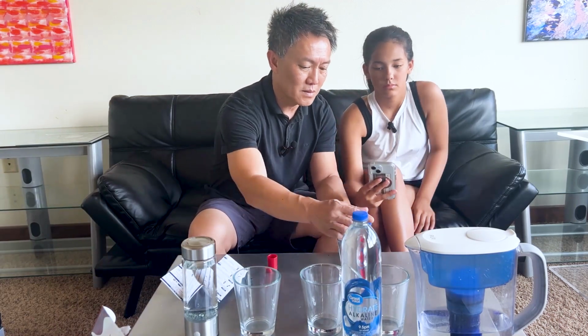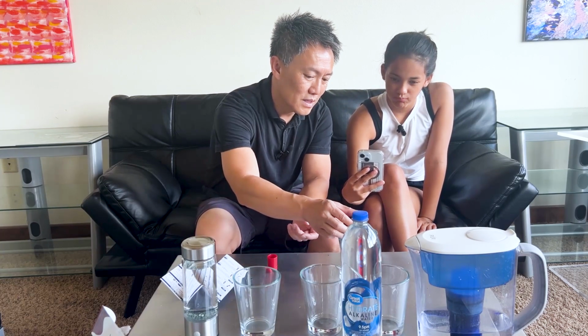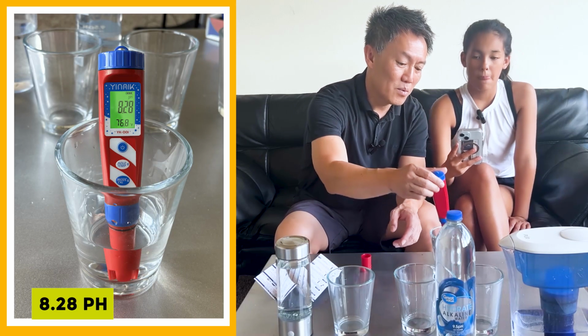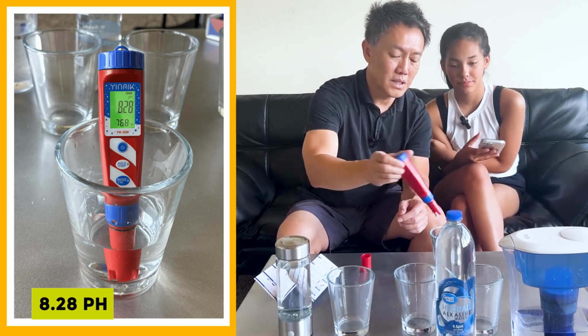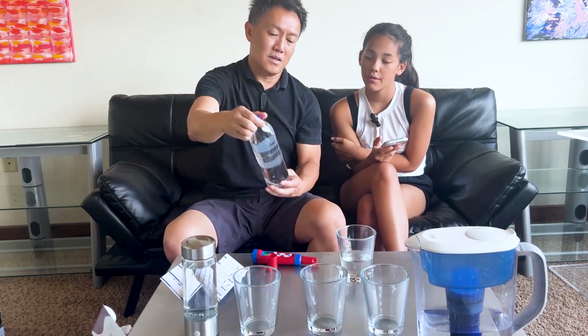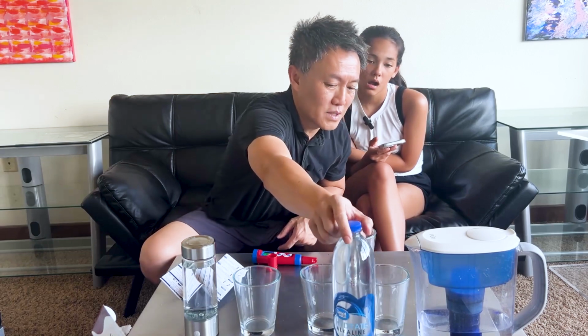And let's just wait a second. I'm assuming we should put it in there for a little while, huh? No, a little longer, I think. So it's saying the pH level for this, wow, it's climbing. I don't think it should be that high. Well, I guess our tap water is pretty high pH. Go ahead and take a picture. It's 8.28. Supposedly, alkaline water is anywhere between 7 and 9.5. In fact, this bottle claims that it's 9.5. We'll see if our hydrogen water will do that as well.